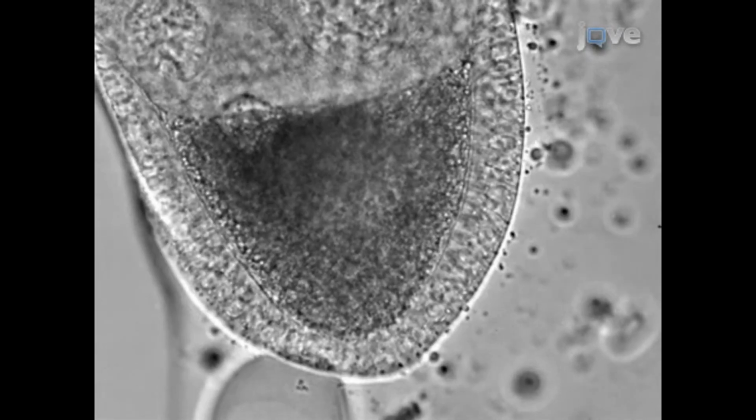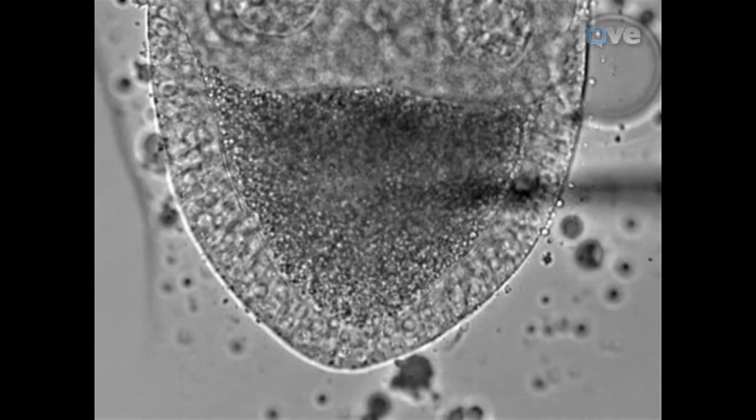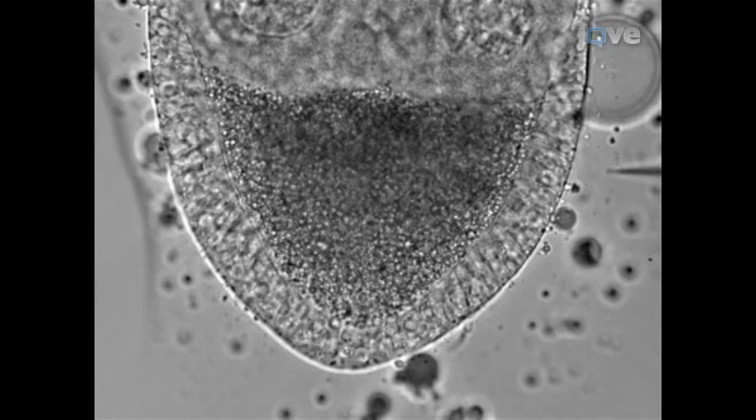Once inside, eject a small volume from the needle and visually assess the effects. Repeat as required. If the injection is successful, the cytoplasm inside the oocyte will be displaced.